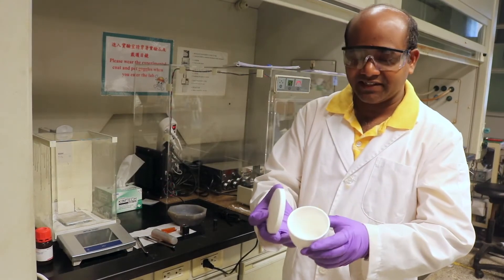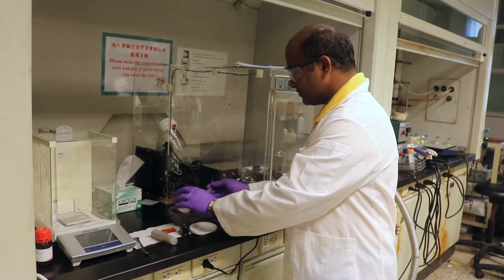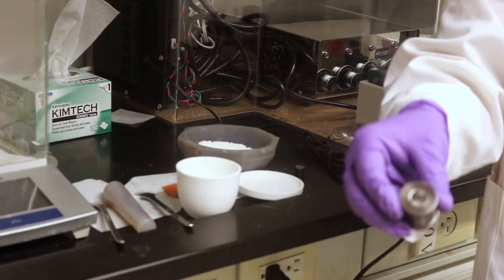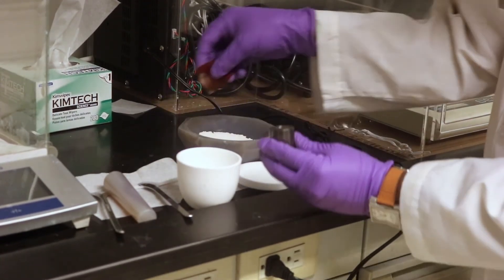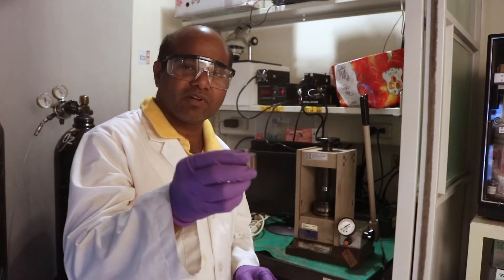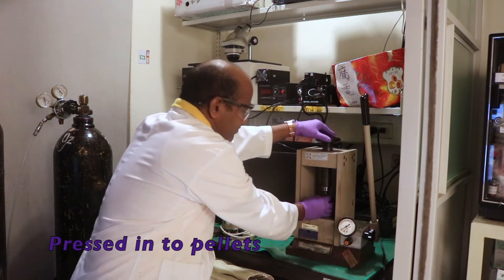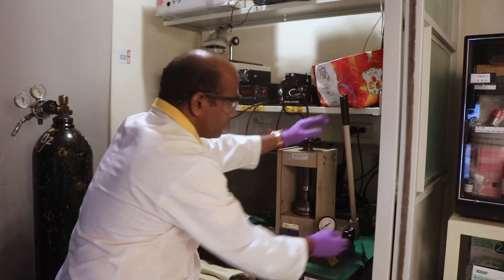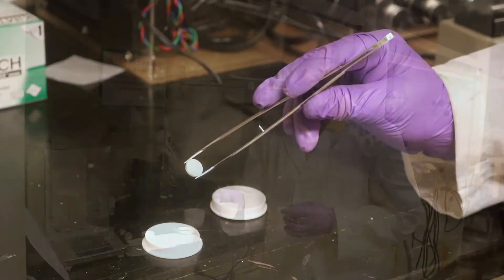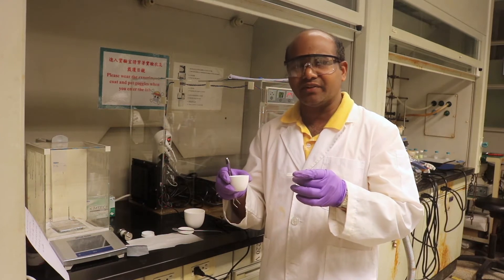After sintering, the powder is again ground to a fine powder and transferred into a stainless steel die. The powder is cold pressed into pellets. The pellet size is 10 mm diameter and 1 mm thickness.